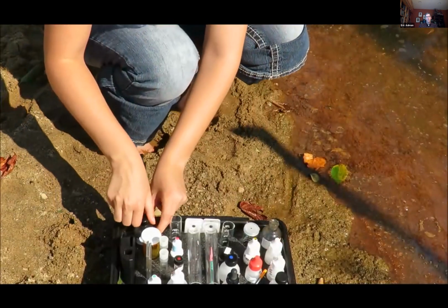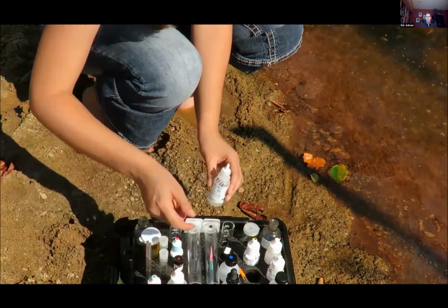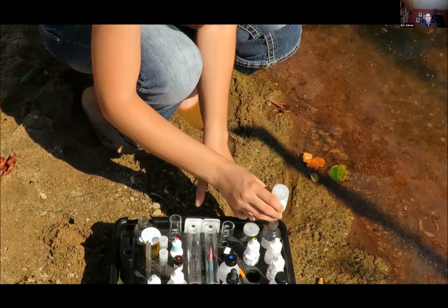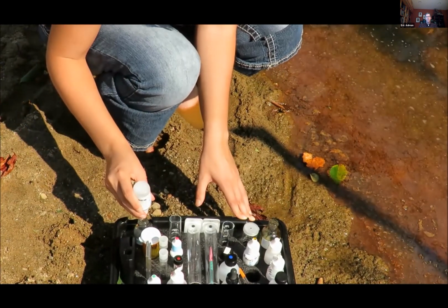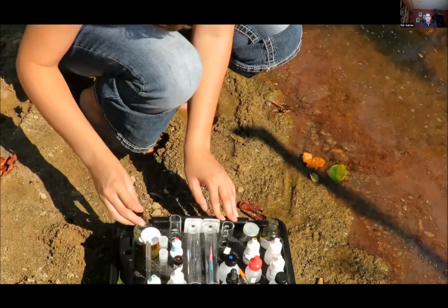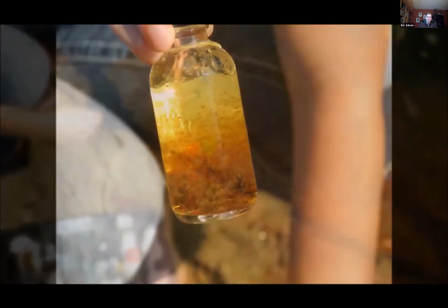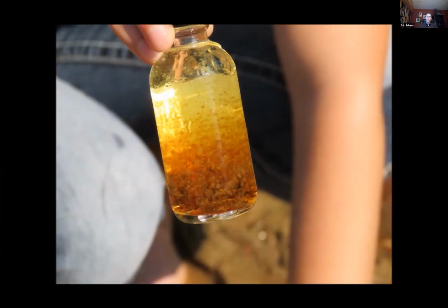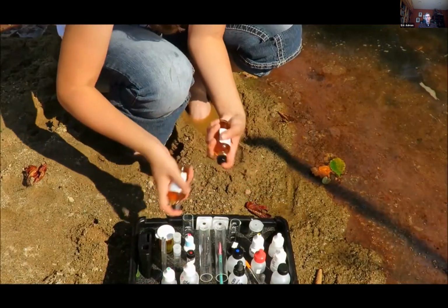Locate the 1:1 sulfuric acid bottle. Add 8 drops to each sample. Cap bottles and rinse the outside. At this point, the sample will contain dark brown flecks. Repeatedly invert the sample bottles to mix until most of the flecks have dissolved.